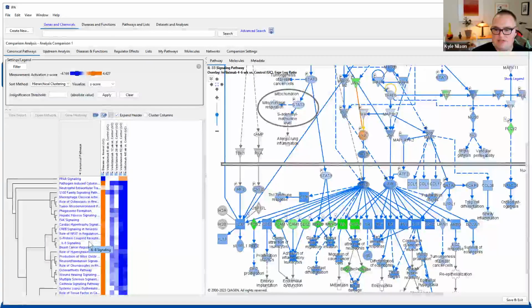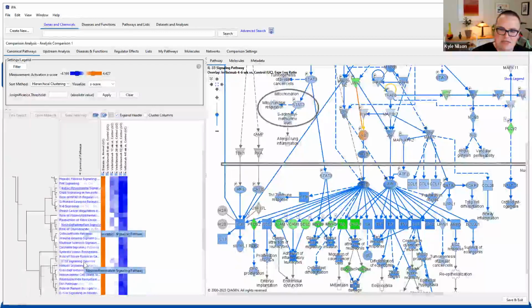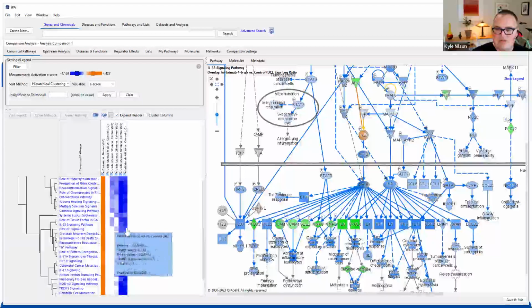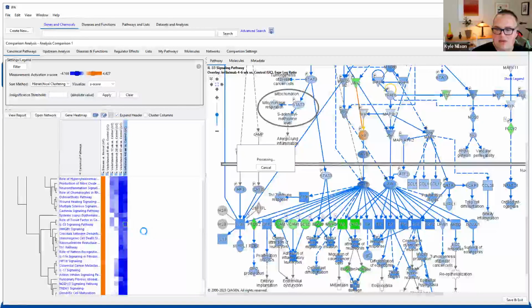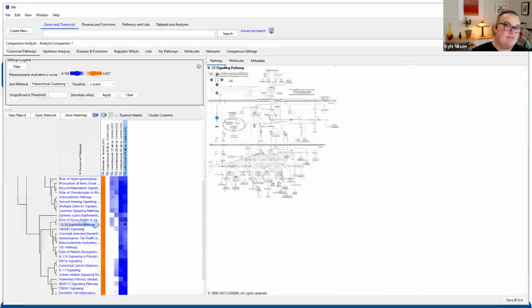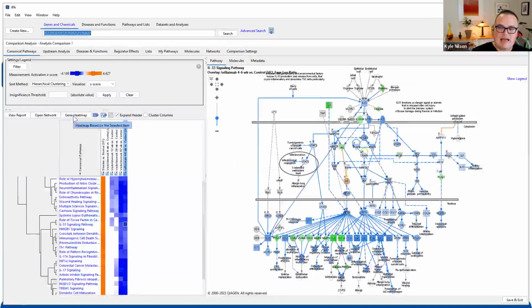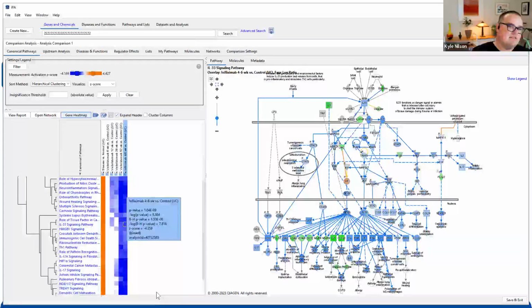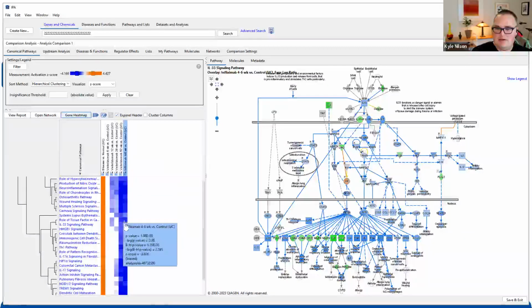So here, for example, the information that I would get for this IL-33 signaling pathway is not going to be gene specific, but if I happen to be looking at this entry, I can load the gene heat map in order to pull up a list of genes. So here, clicking this gene heat map would load the relevant gene in a window.